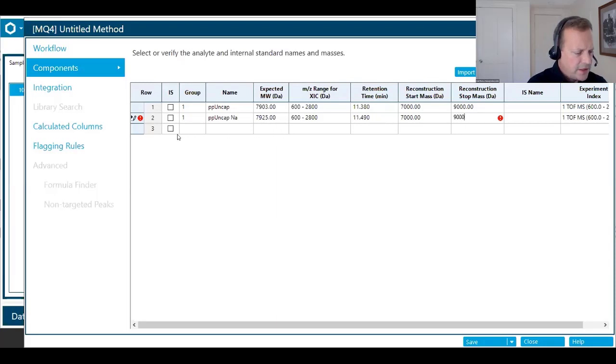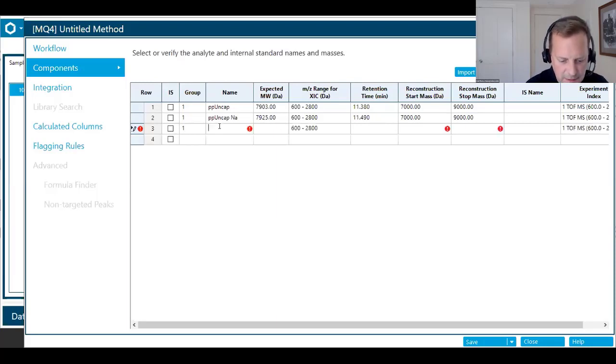All right, I'm going to throw in the GCAP here. GCAP is 8328, and here is 11 point. Actually, this is 11 point, we'll call it 38. So the GCAP, actually, the addition of the guanosine, we do get a little bit of separation within the peaks, so that elutes a little later. And similar with adding the methyl groups, that causes a little bit of retention time delay as well.